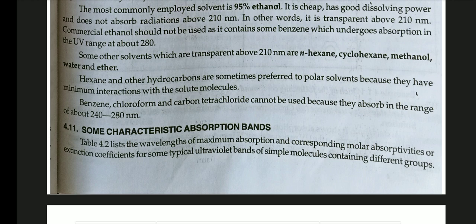The wavelength of maximum absorption and corresponding molar absorptivities or extinction coefficients of some typical ultraviolet bands of simple molecules containing different groups.